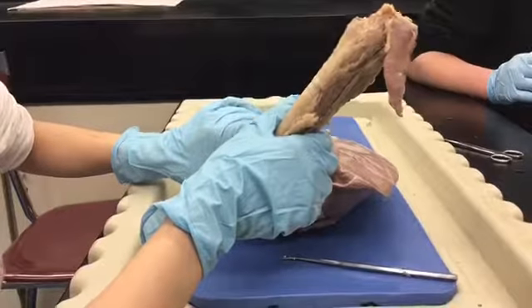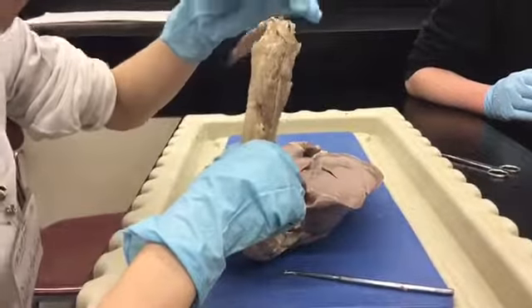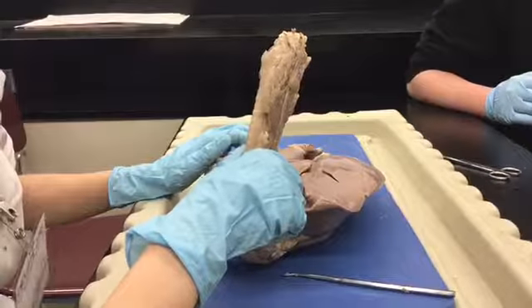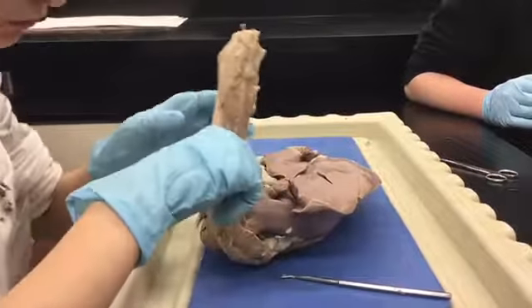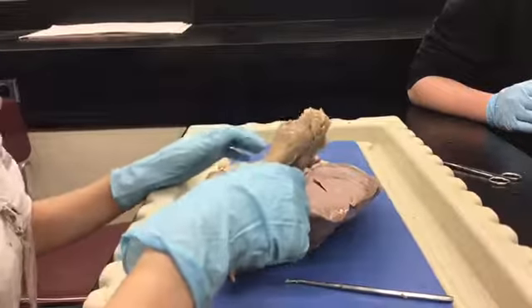Some of you will notice there is extra connective tissue up here. You might actually have a little bit of esophagus and thyroid present. Most of you will think you don't. All this extra tissue, you can cut off.